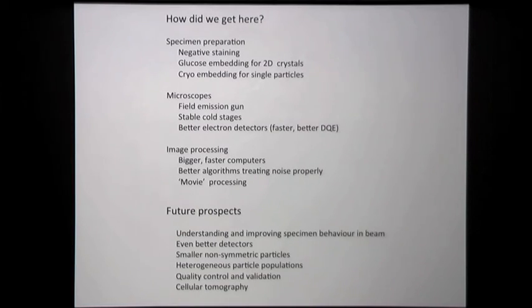For something where you have repeated copies in your tomogram, subtomogram averaging is going to be important. But if it's just cellular tomography and you want to see the general structure in the cell, I think that's going to be problematical for a long time, just because of radiation damage. And because it's a single unique structure in a cell, it's very hard to see how one can overcome the radiation damage.